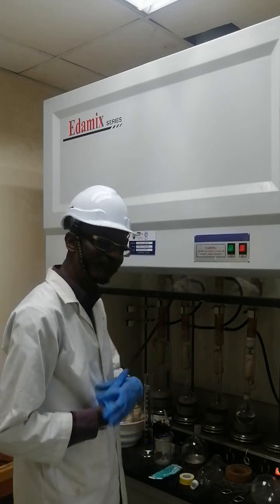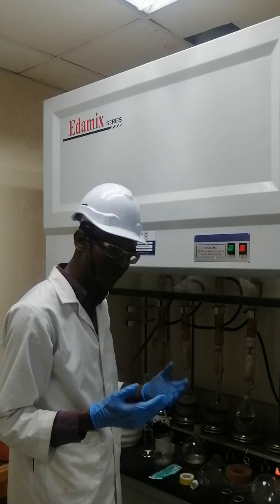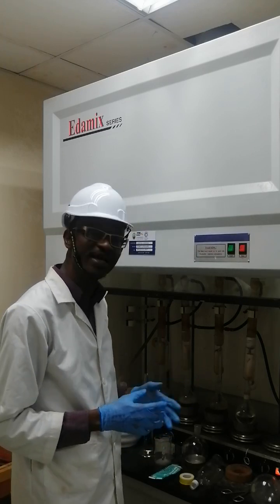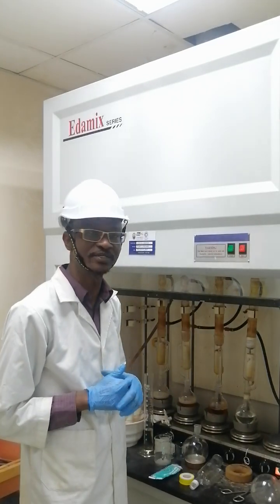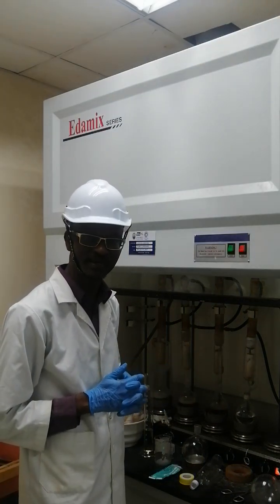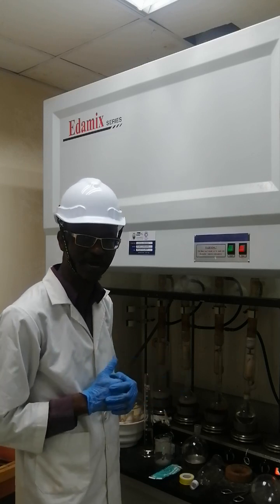So now, is it possible for us to carry out extraction using Soxhlet if there is no cooling water for the condenser? The answer is no. We cannot carry out extraction if there is no cooling water for the condenser. If there is no cooling water supply, extraction cannot be carried out.